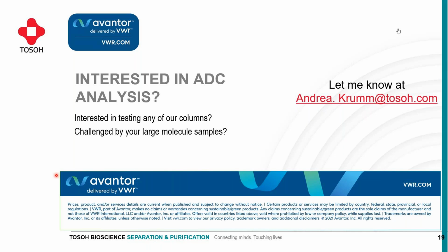However, at least for FcR affinity chromatography and for size exclusion chromatography, it works, and there are publications that show that mass spectrometry can be used together with those methodologies by just switching to a volatile buffer.